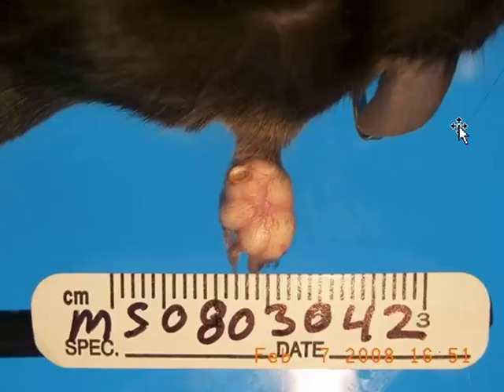Here's another case of staphylococcal pododermatitis resulting in botryomycosis. So it's not simply confined to the areas of the face.